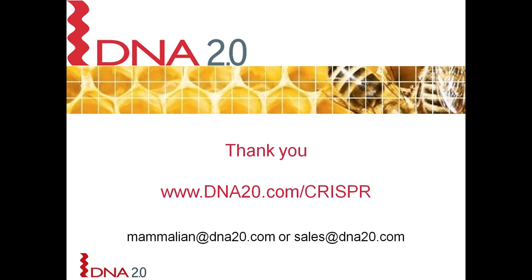So thank you again, Dr. Patel, for this wonderful introduction to the CRISPR technology. The first most common question was, can you further explain indel frequency and how it's measured?